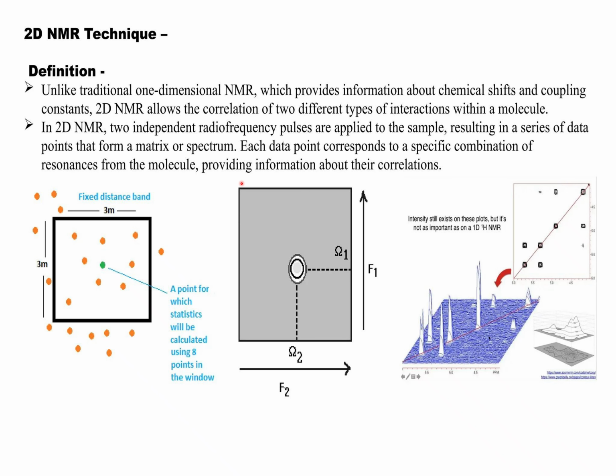Now we'll discuss different 2D NMR. These are some improved NMR techniques. 2D NMR looks just like 2D TLC. In 2D TLC you have some spots like that. Then you rotate the plate by 90 degrees and run another TLC, and then all of the compounds will be separated again. You have a very clear idea about the nature of the compounds.